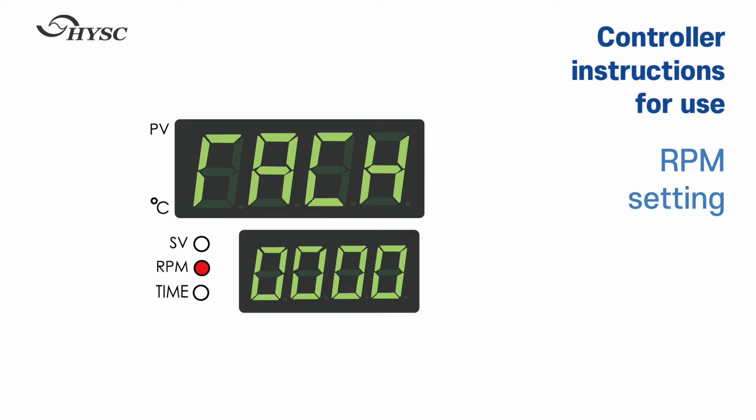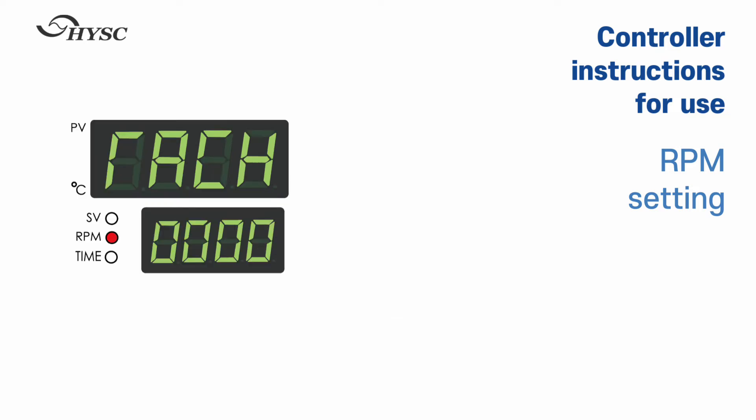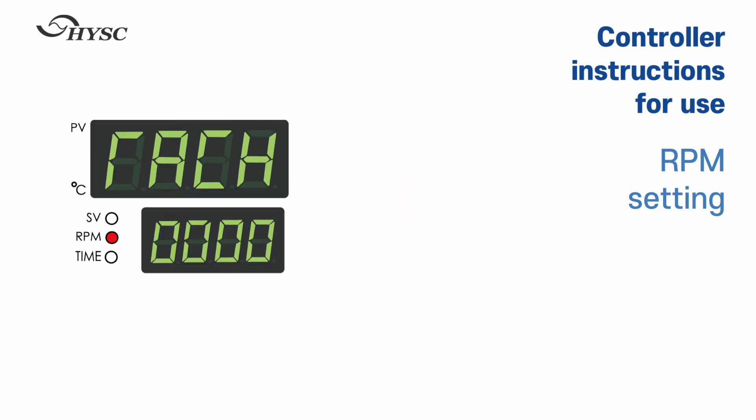This is a guide for RPM setting. After setting the temperature, press the mode key once again to set the RPM. Or press the mode key twice in the initial state to set the RPM.